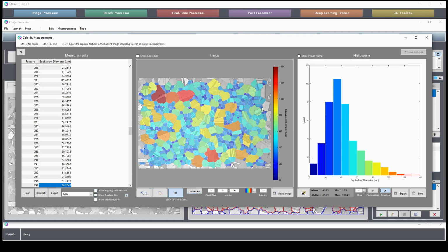All of this can be further customized, of course, with a change in color scale, a change to your color limits, formatting changes, additional bins in the histogram, and so on. And all of those customizations can then be saved right back into that recipe step. So the next time you or one of your users runs the recipe, they can produce the customized measurements with a single click. All of this can be exported, both the individual graphics and underlying data, as well as full formal reports.